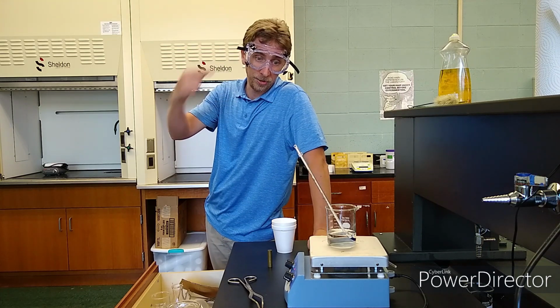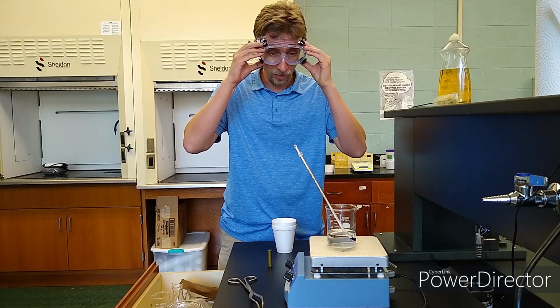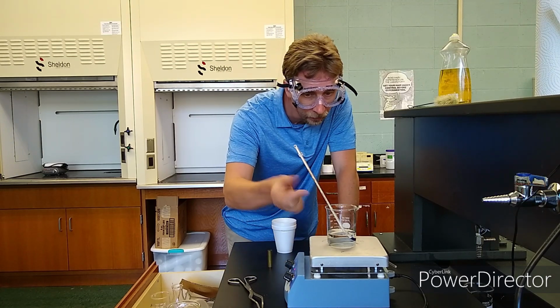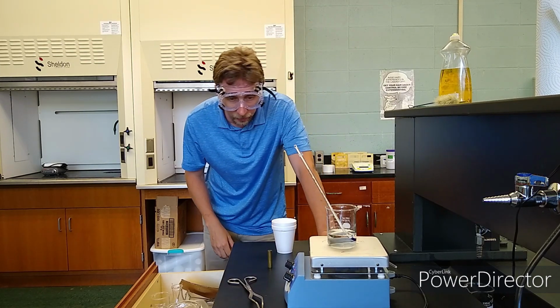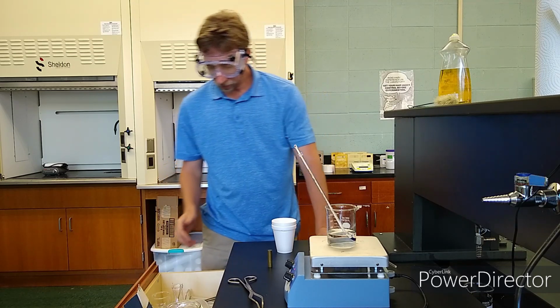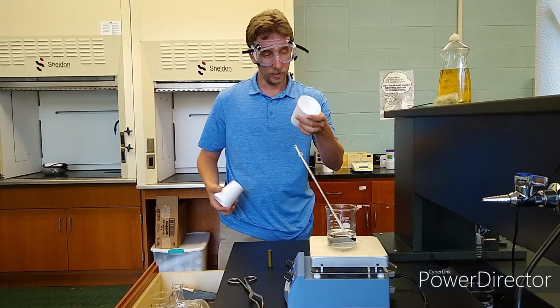Safety goggles. Don't forget, safety first. Now, this water has gotten up to, well, only 39 degrees so far. It's got a ways to go on that temperature. In the meantime, I'm going to be going over the rest of the supplies that we need here for this experiment. We got two, well, let's look at it.